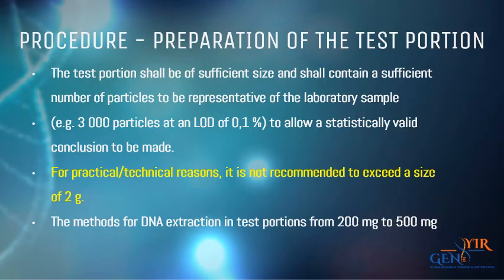Preparation of the test portion. The test portion shall be of sufficient size and shall contain a sufficient number of particles to be representative of the laboratory sample, for example 3000 particles at an LOD of 0.1%, to allow a statistically valid conclusion to be made. For practical or technical reasons, it is not recommended to exceed a size of 2 gram.